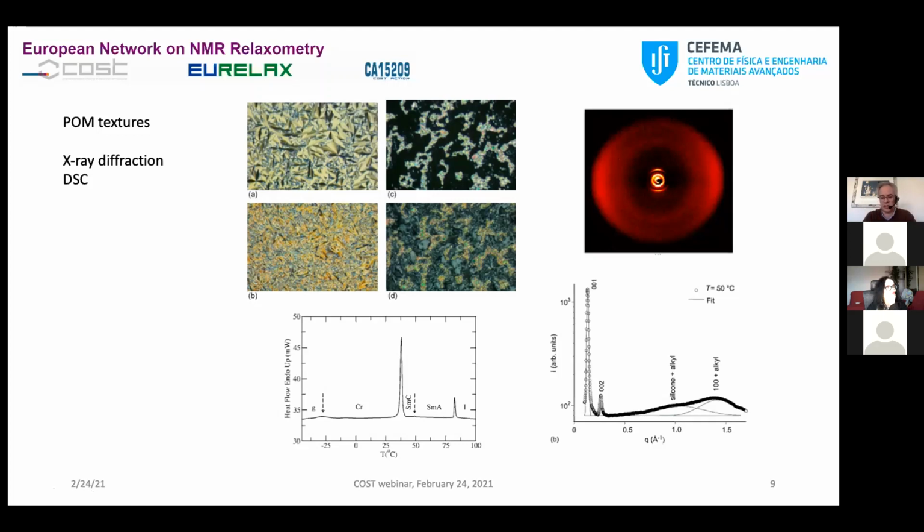Therefore, if there is order in the system, we cannot ignore the possibility of the rotations not being completely independent of each other. Therefore, it will help to discriminate what type and importance of the relative mechanisms. And if you add that with the temperature, how the temperature will affect each one of these contributions, then we have a way of discriminating this.